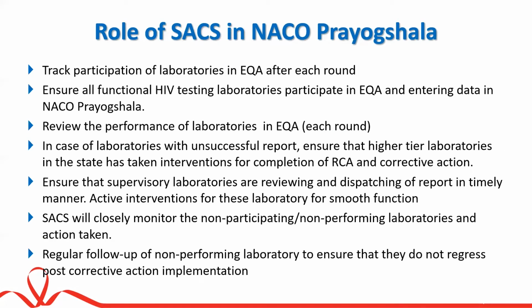So what is the role of SACS in NACO-Prayogshala? This is the SACS module, where the NACO-Prayogshala can be operated by SACS persons and representatives, and the SACS can monitor their state performance for the external quality assessment programs.